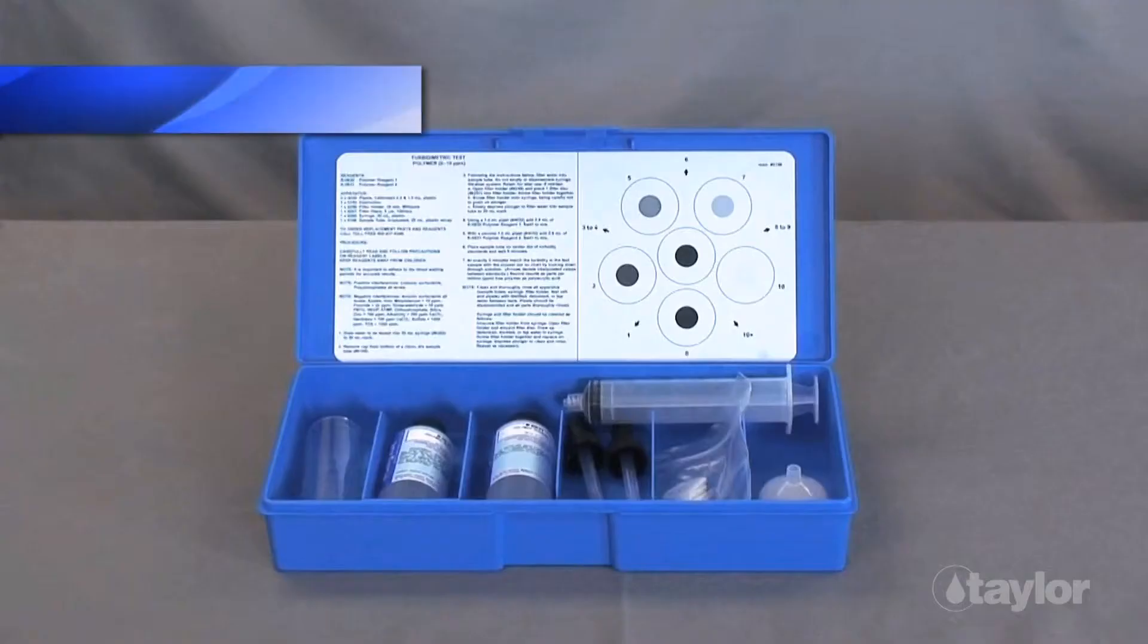The polymer test kit, K1190, is designed for water treaters using polymer treatments in either boiler or cooling water.